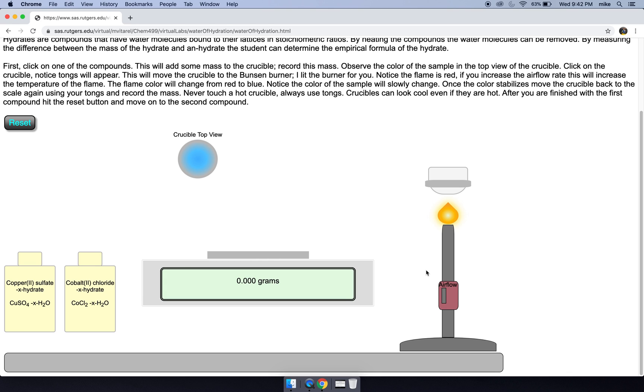But let me increase the air flow rate. If I increase the air flow rate, the flame becomes blue, that's much hotter. So the sample is desiccating faster, notice the color is changing faster.